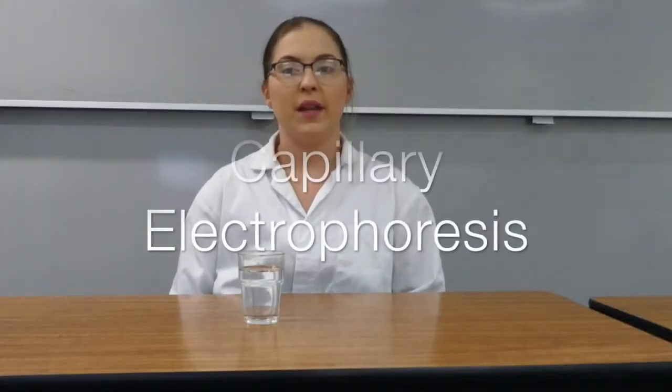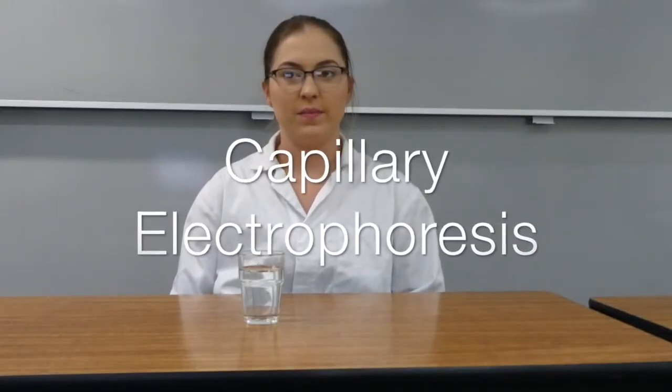I want to use capillary electrophoresis, or CE, to determine the magnesium content in our lake water samples. CE is the separation of molecules using electricity and a capillary. So how does CE separate the analyte that you want? Using the analytical method CE, ions can be separated not only by their charge, but also by their size.